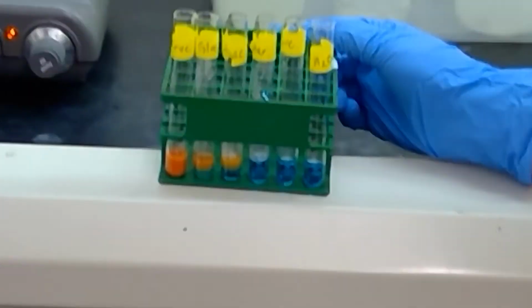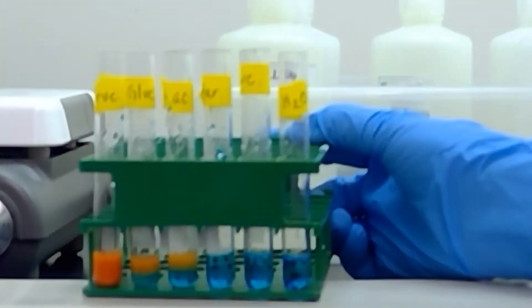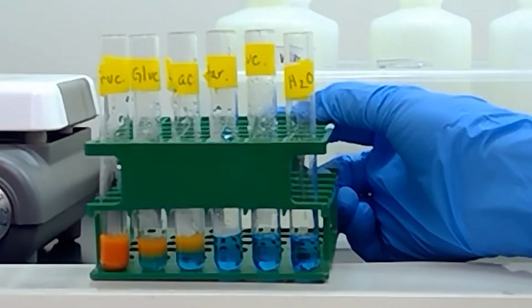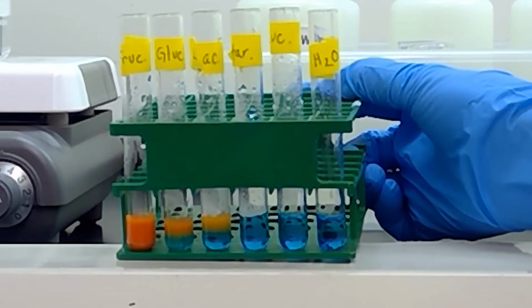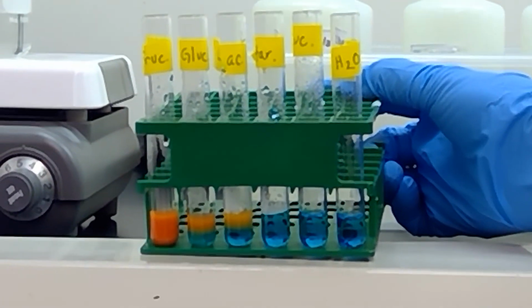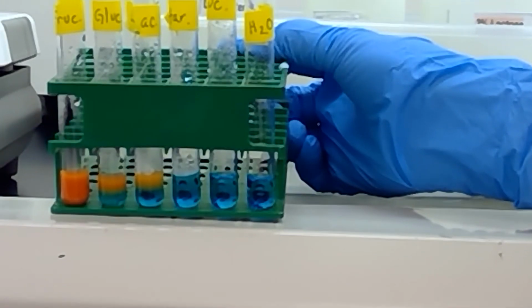Okay, so here are the results of the Benedict's test, where we have fructose, glucose, and lactose showing us a reduction. Starch, sucrose, and water are negative. This has been the Benedict's test for carbohydrates.